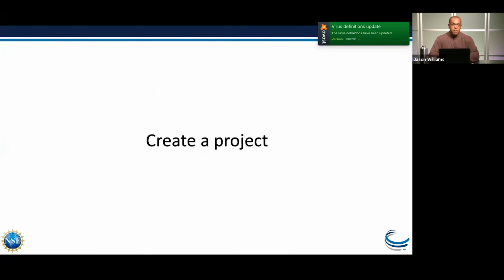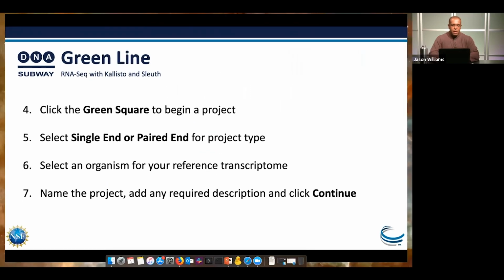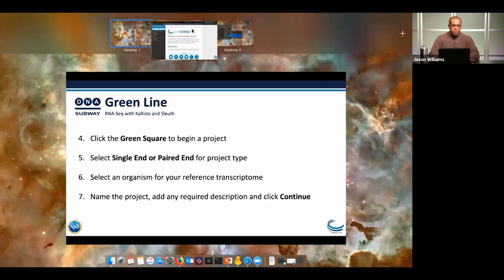Okay, so the very first thing you're going to do is create a project. And the steps are here, and I'll give those to you, the slides, I'll post them. So I'll just show this to you, and you can have that for reference. Okay, so let's take a look at doing that.